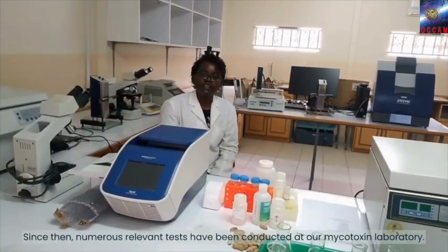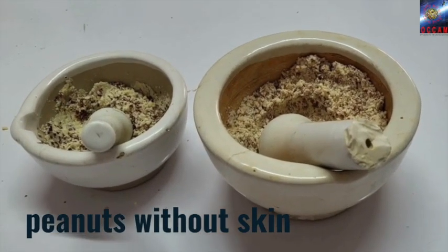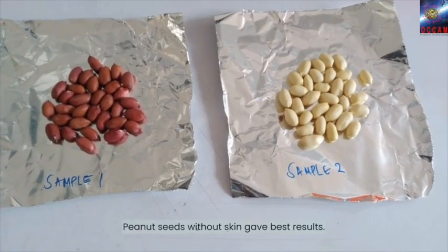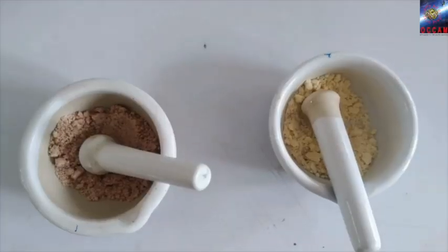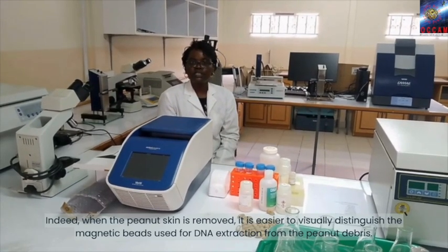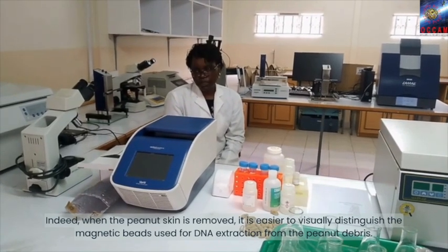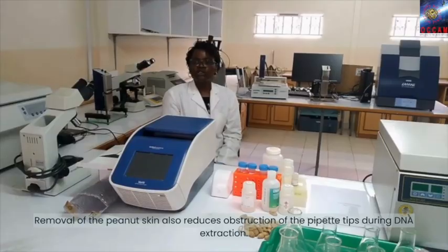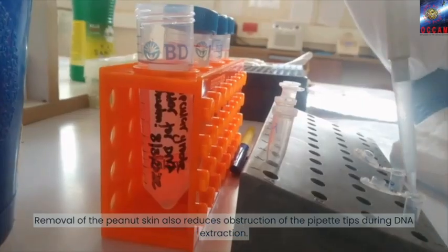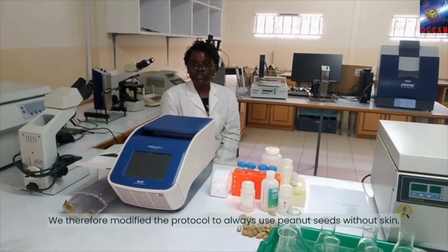Since then, numerous relevant tests have been conducted at our mycotoxin laboratory. Peanut seeds without skin and peanut seeds with skin were used for the experiment. And peanut seeds without skin gave the best results. Indeed, when peanut skin is removed, it is easier to visually distinguish the magnetic beads used for DNA extraction from the peanut debris. Removal of the peanut skin also reduces obstruction of pipette tips during DNA extraction. We therefore modified the protocol to always use peanut seeds without skin.